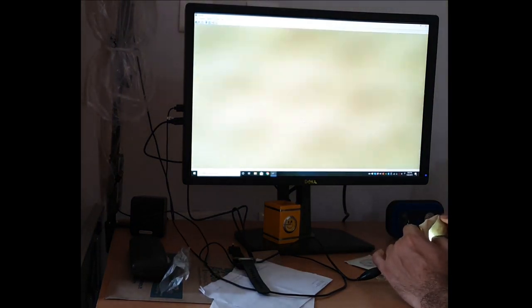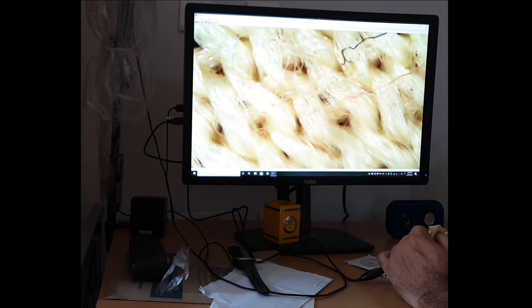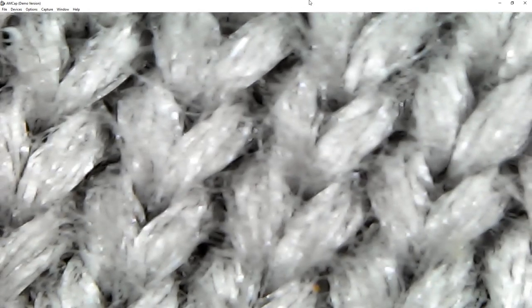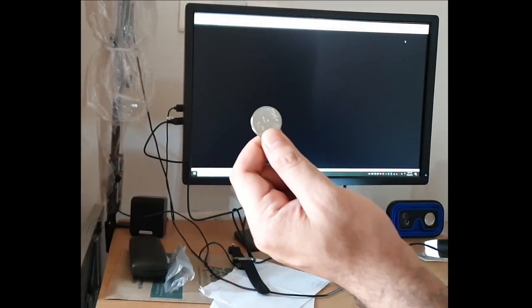The first thing I actually scanned was a piece of cloth used for cleaning spectacles and I was really amazed — look at the amount of zoom it has. I just kept the cloth right in front of the microscope and it gave me a good image. Then I took a coin and started looking closely at it, which was nice. It just takes a little bit of effort to get the focus, but once you do you'll be able to see some amazing things.